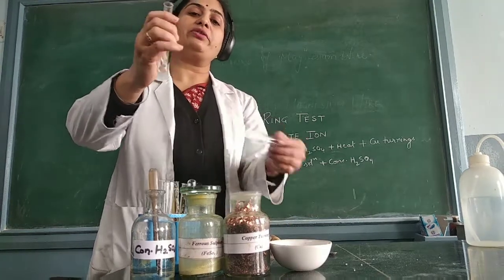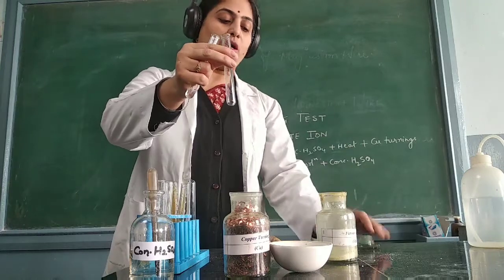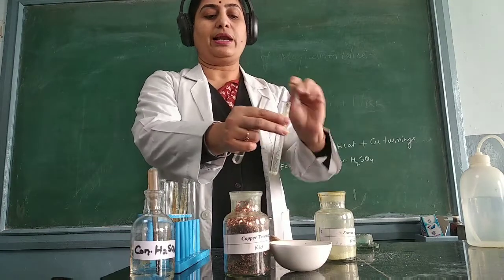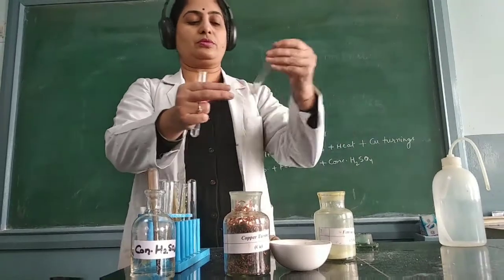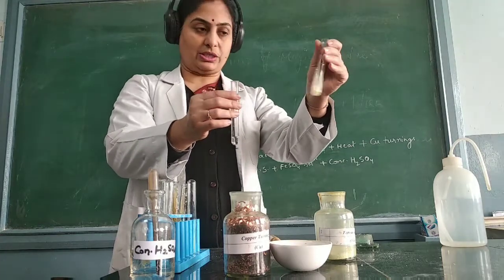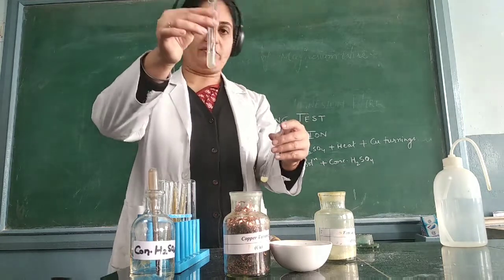Next, I need freshly prepared ferrous sulfate. For ferrous sulfate, I take a small amount of ferrous sulfate in a fresh test tube and then add some amount of water to it. Mix it well — this is our freshly prepared ferrous sulfate. We always need to use freshly prepared ferrous sulfate, and I now add it to the original solution.